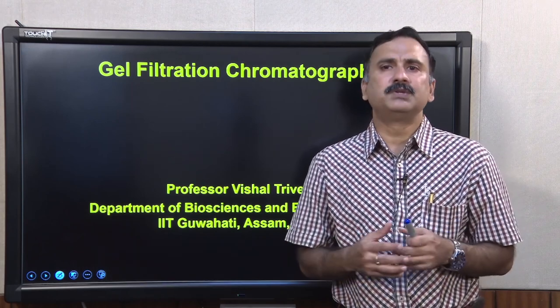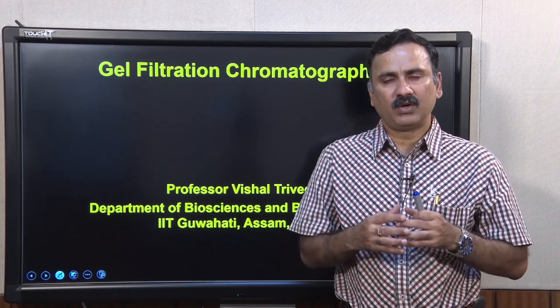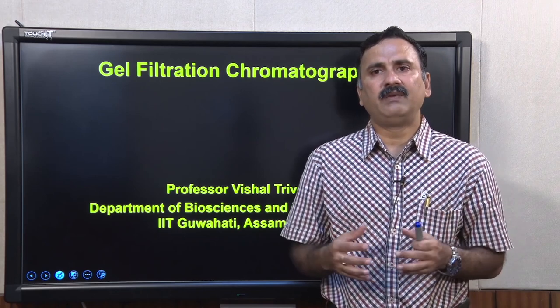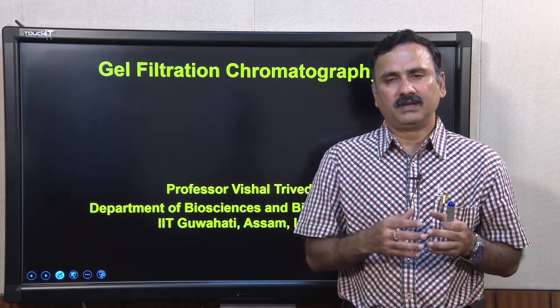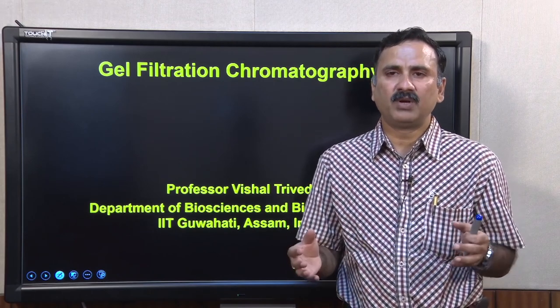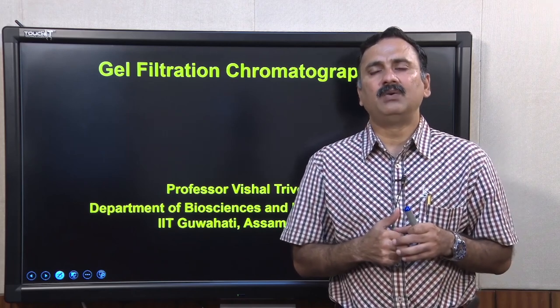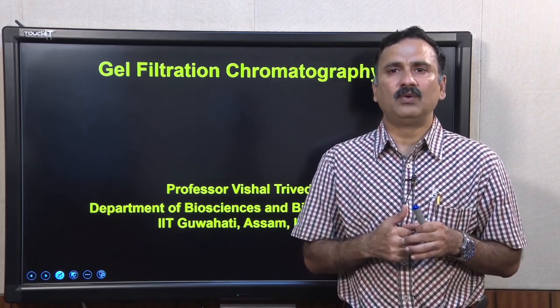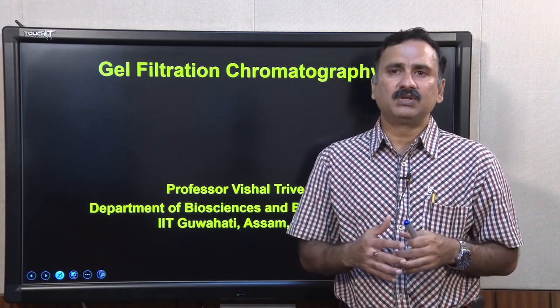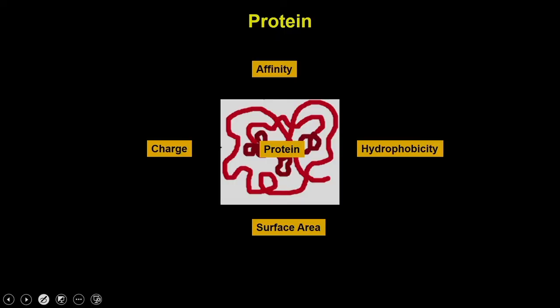And in this course, so far we were discussing chromatography. In the beginning we discussed the basics of chromatography, and then we discussed protein systems and how to operate them. In the previous two lectures we discussed ion exchange chromatography followed by hydrophobic interaction chromatography. Now, in today's lecture we are going to discuss gel filtration chromatography.